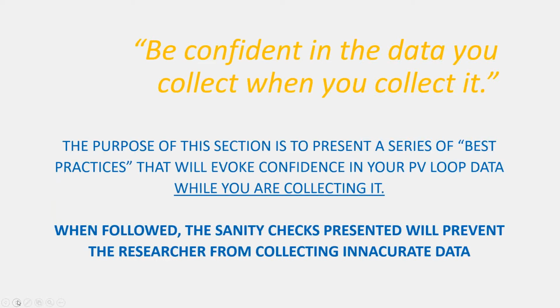So the main thing is to be confident in the data you collect, but do it when you're collecting it. The time to invest in data quality is before you perform the experiment. So due diligence in selecting the proper equipment to use with your PV system. Know how to use it will save time and animals when you're performing data analysis later on.